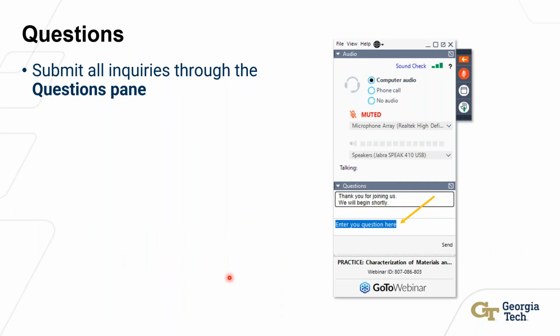It's a little bit arbitrary what you call unindexed, but we essentially just set a reliability index cutoff as we're saying this is indexed and this is not indexed. So unindexed patterns are patterns that just fall below a certain reliability index threshold. Setting that threshold is based off observations. You can usually tell when looking at these orientation maps when something just doesn't make sense, when you have noise in the patterns, and you can use that to set the reliability index threshold.